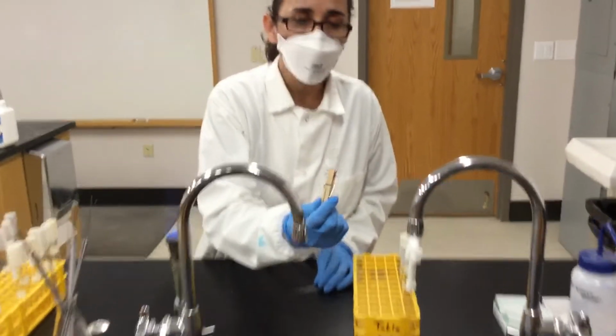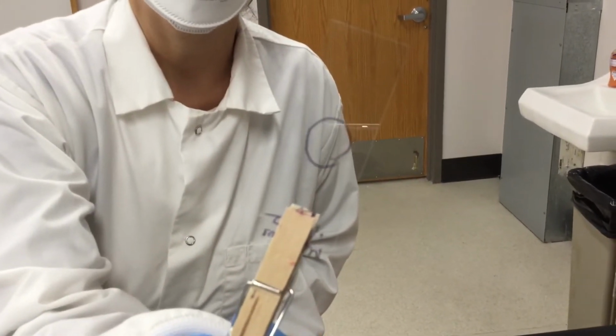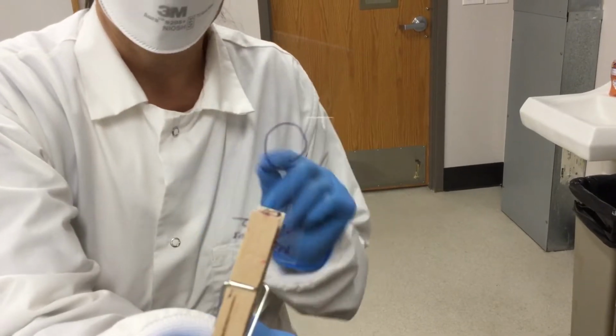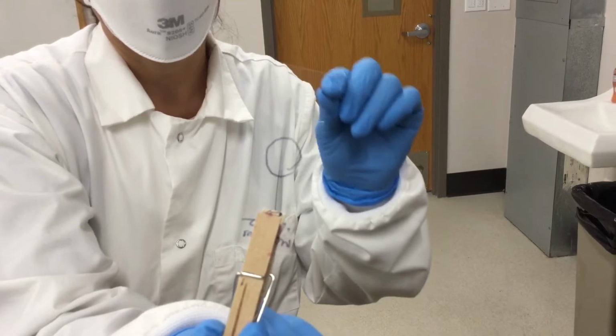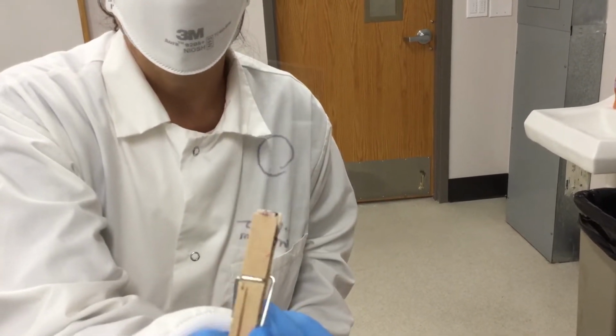So now let me show you how a good smear looks. As you see, it's not very thick. Thickness can be seen when you see a white film. And this is kind of opaque, but not that much.